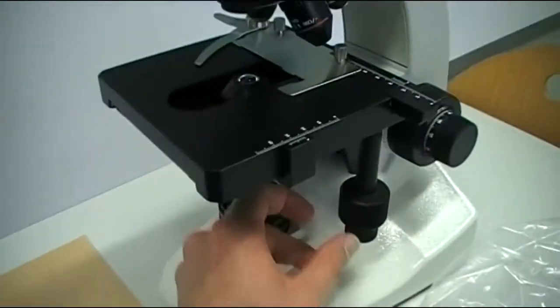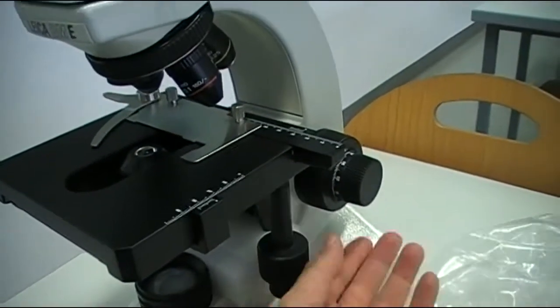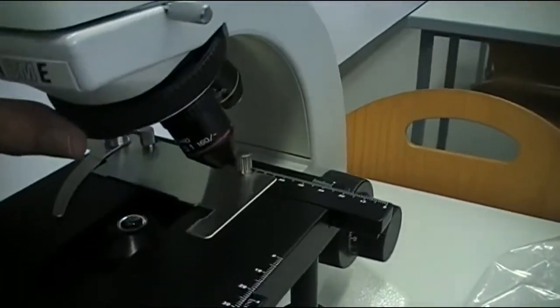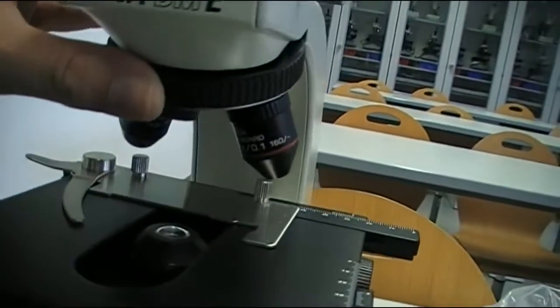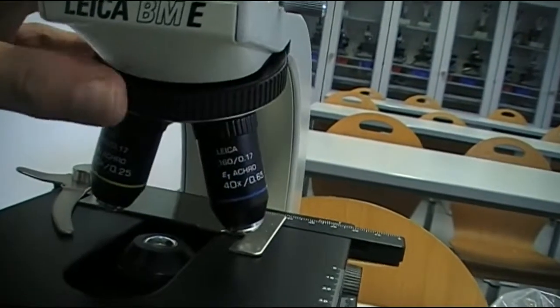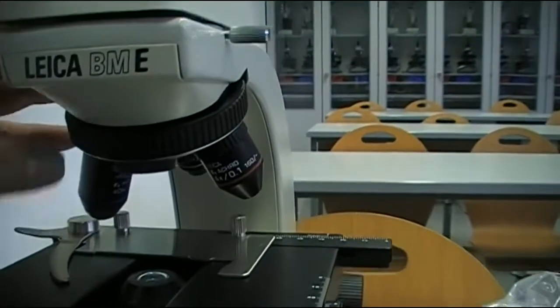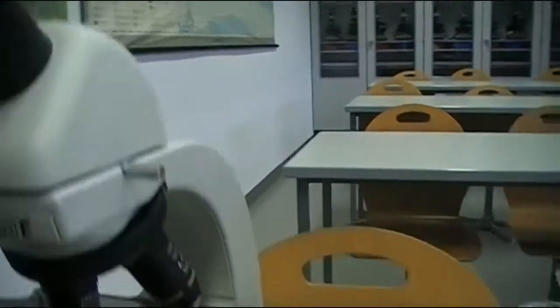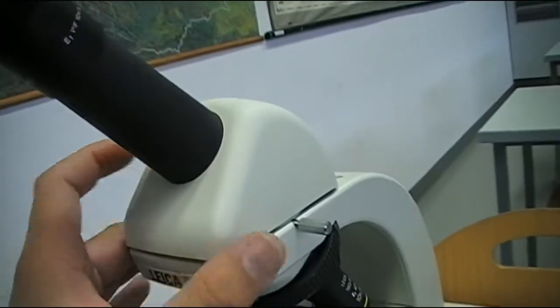The mechanical stage operates very smoothly. Rough and coarse focus — okay. What objectives do we have here? We have a 4x, 10x, and 40x objective, with the possibility to attach a fourth one. Rotates nicely.